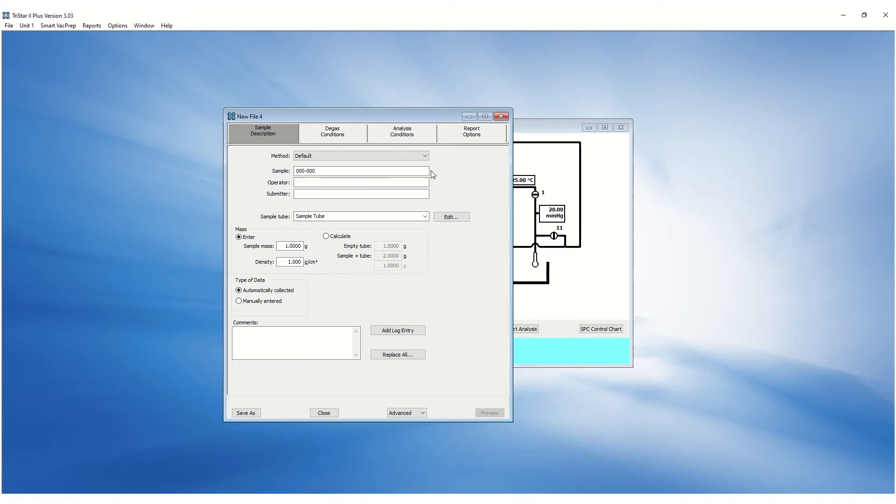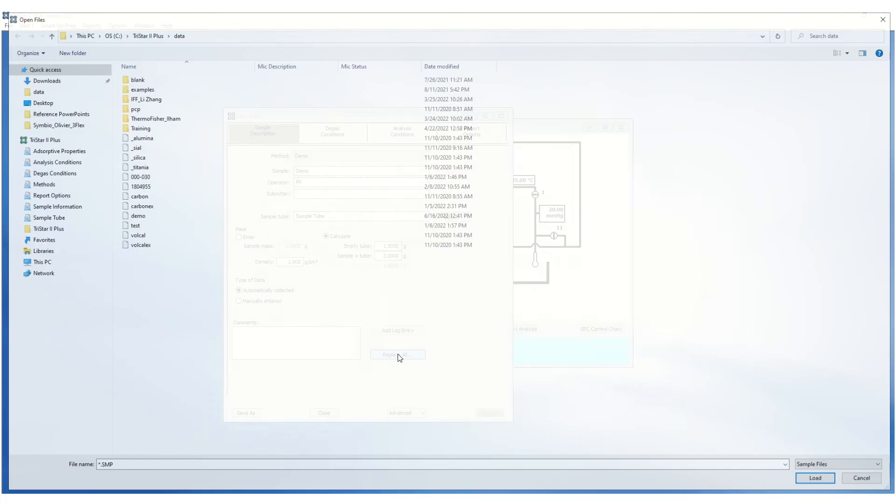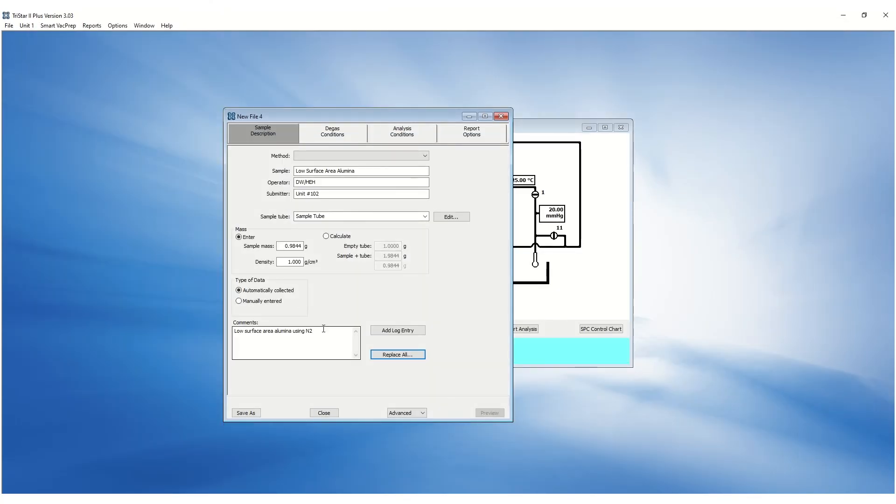The saved method will appear in the Method drop-down menu under the Sample Descriptions tab, or you can create a new sample file. Click on the Replace All button to browse and select the sample file you wish to copy. This allows copying all the parameters of an existing without the data.